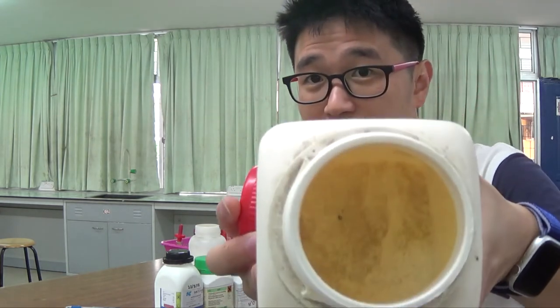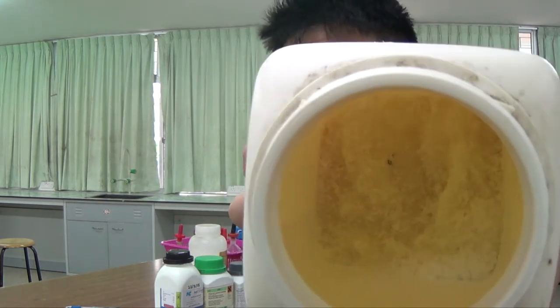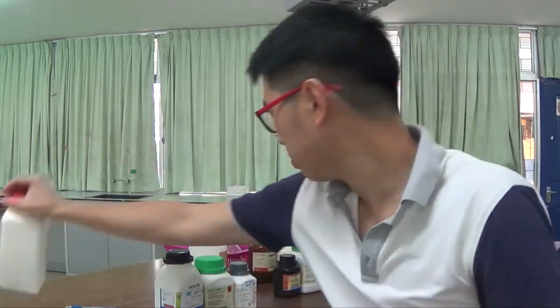This is a very old sample. It's supposed to be white color, but they are very crystalline. So when I dissolve it in water, they're supposed to give me a solution.